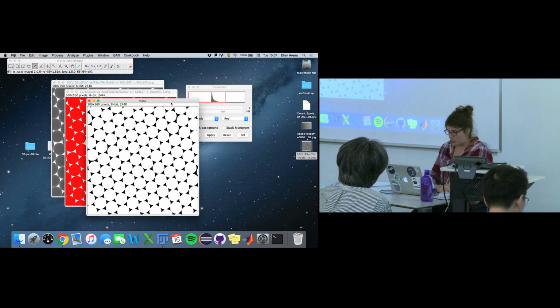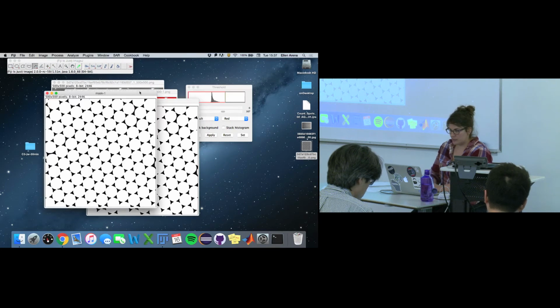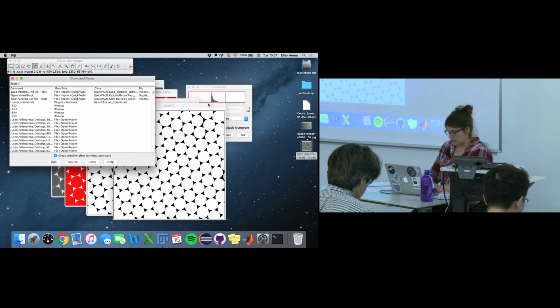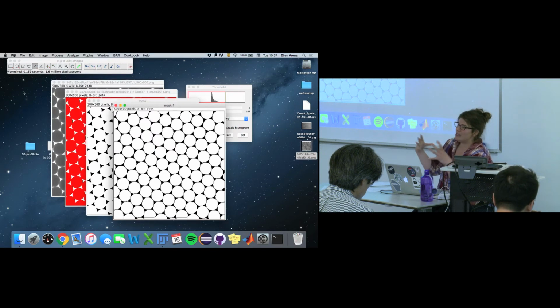So first, let's just duplicate this mask. Okay, so now we have two masks, and on one of them we're going to watershed, so separate circular objects. So obviously, okay, it's not perfect in its circularity, but if you check the forum thread, they did different segmentation steps that actually gave you smoother circles. But for demonstration purposes today, we're just going to do a quick nerdy segmentation, because in the end, all they cared about was counting these objects, okay?